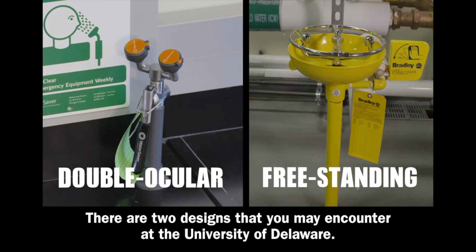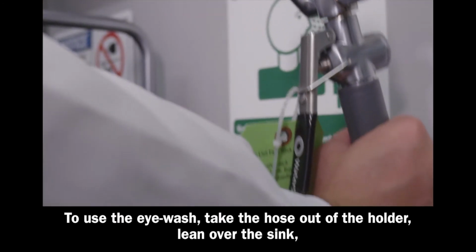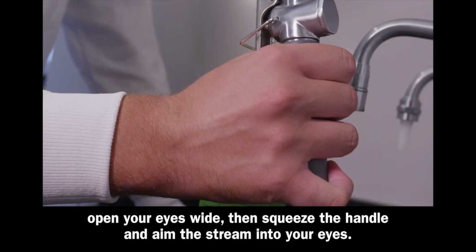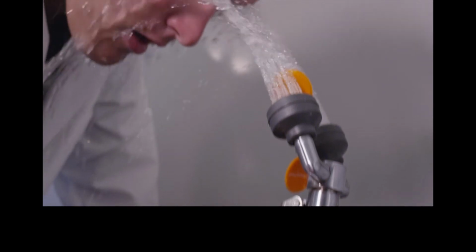There are two designs that you may encounter at the University of Delaware: a double ocular with a hose attached located near a sink, or a freestanding eye wash. To use the eye wash, take the hose out of the holder, lean over the sink, open your eyes wide, then squeeze the handle and aim the stream into your eyes, and continue to run water into your eyes for 15 minutes.